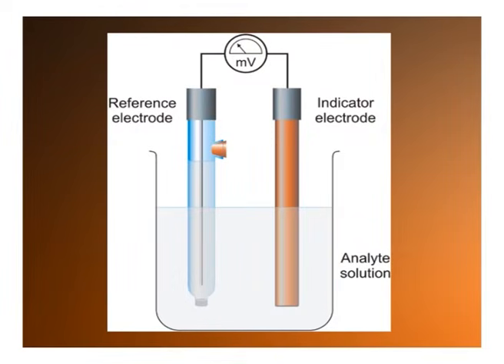In potentiometry, the analytical setup comprises two electrode systems, that is the indicator electrode and the reference electrode, which when placed together in an apparatus containing solution form an electrochemical cell and produce a certain potential value. So, this method is used to quantify the electrical potential of that solution using a two electrode system. Then this potential value is related to the concentration of analytes of interest which are present in the solution.